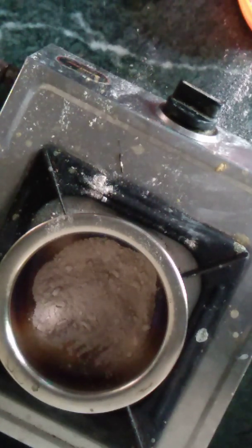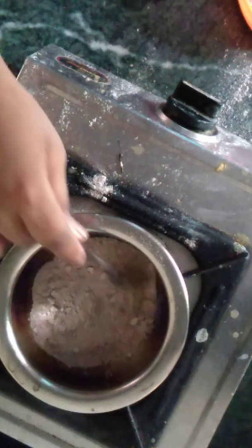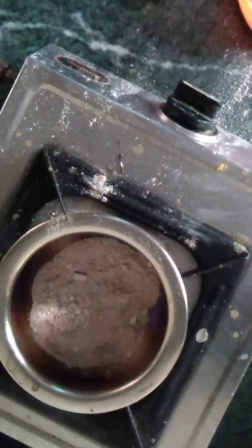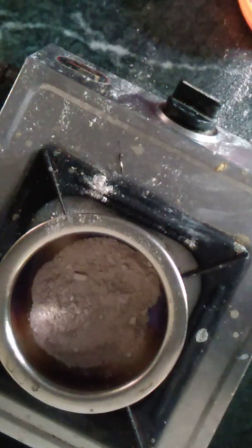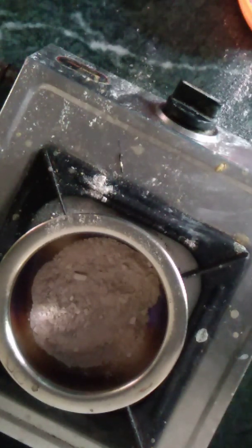We have again started the heating. And it's good news that calcium oxide forms at a temperature of 825 degrees Celsius, and the melting point of this steel container is 1370. So we can get a little calcium oxide. So we should wait for this yield. So let's wait for a while. I won't be fast forwarding the video. You will see all the steps that are happening inside the container while forming the calcium oxide.